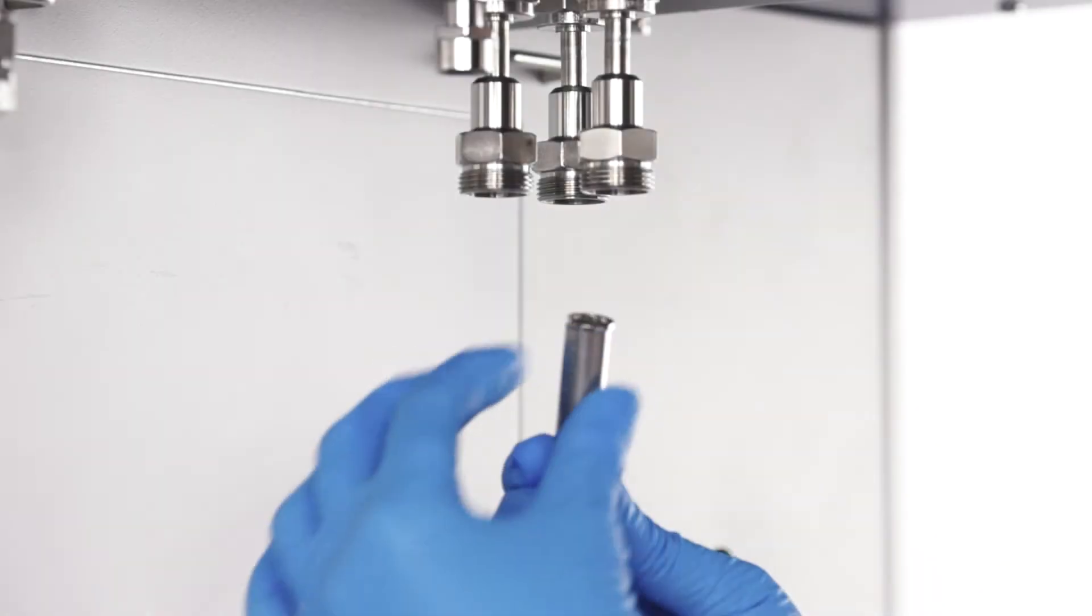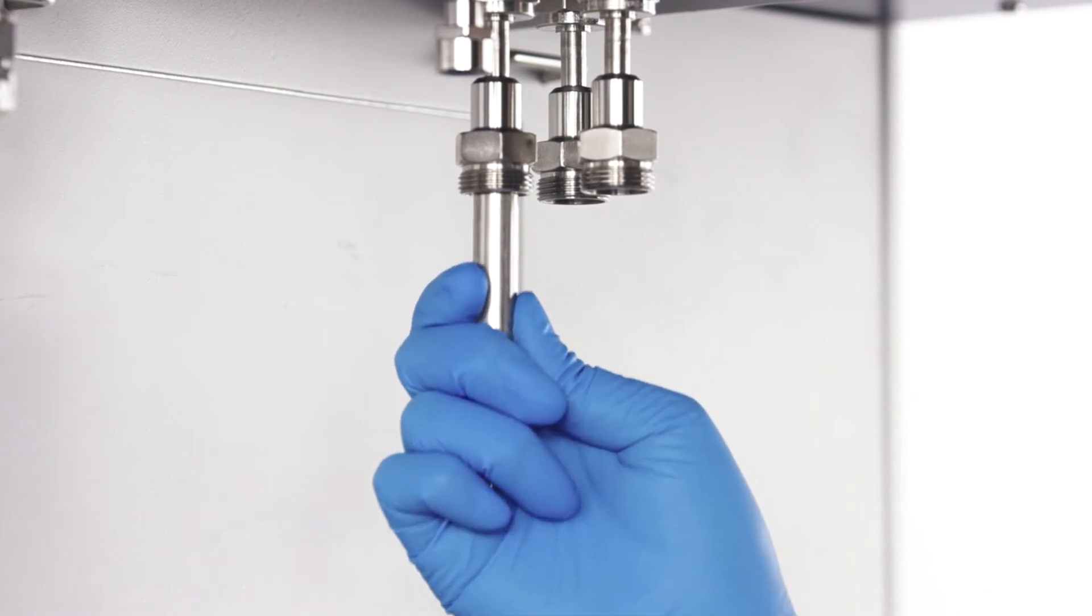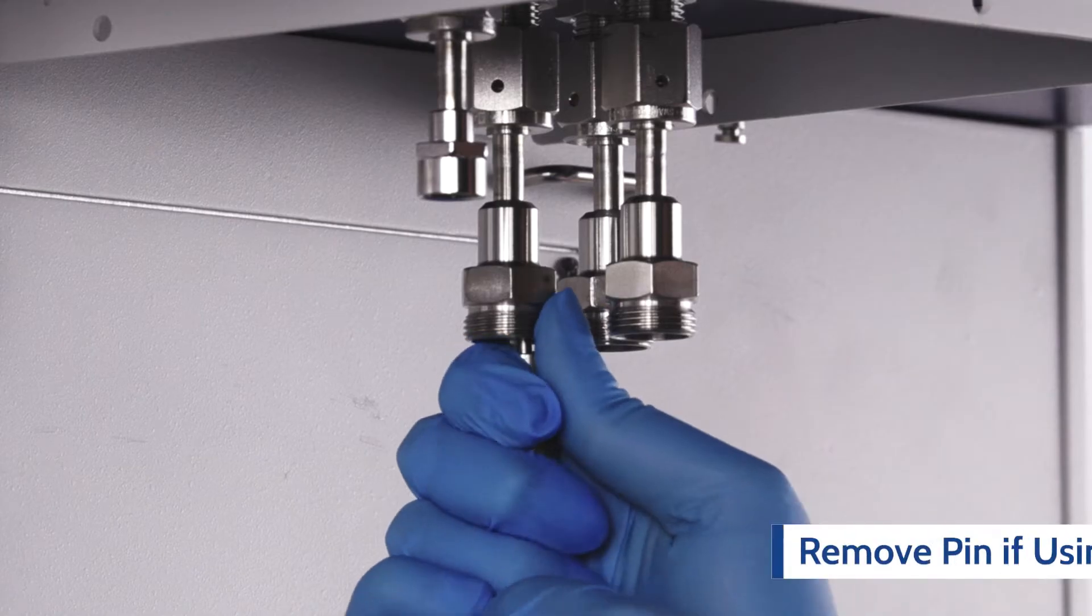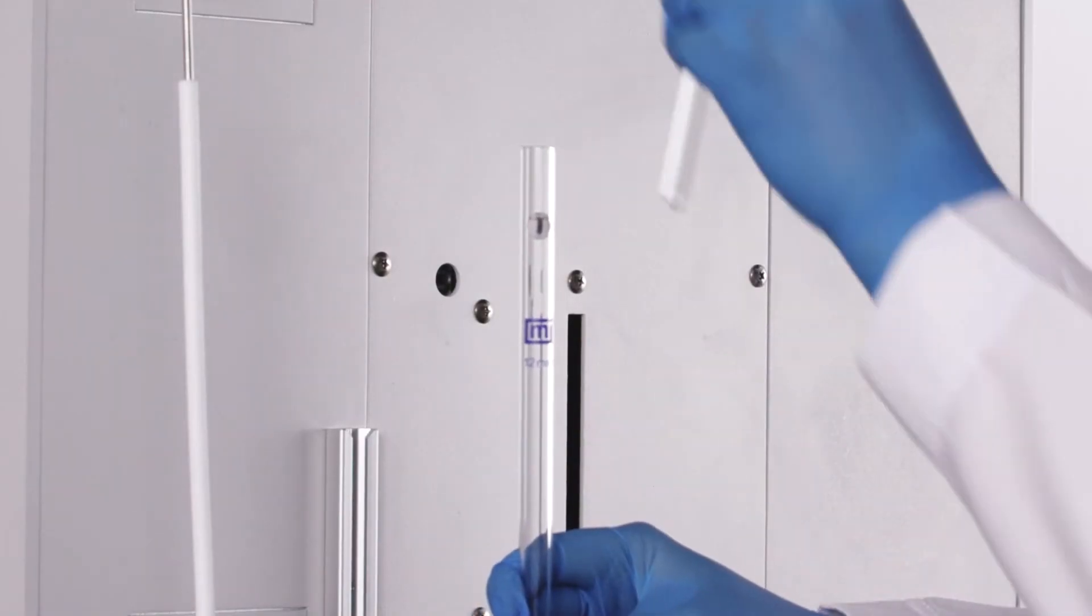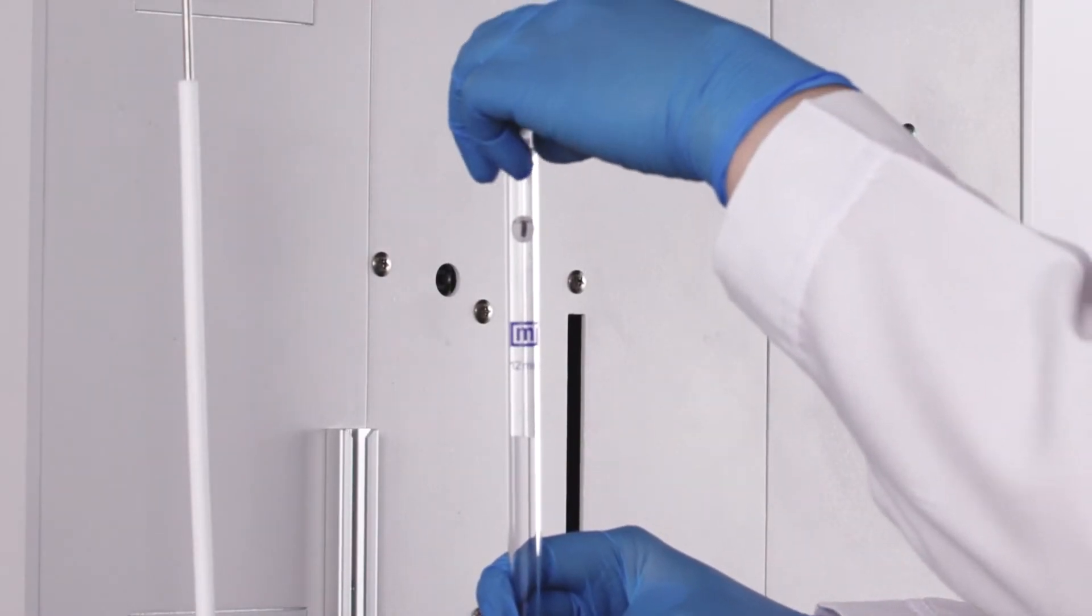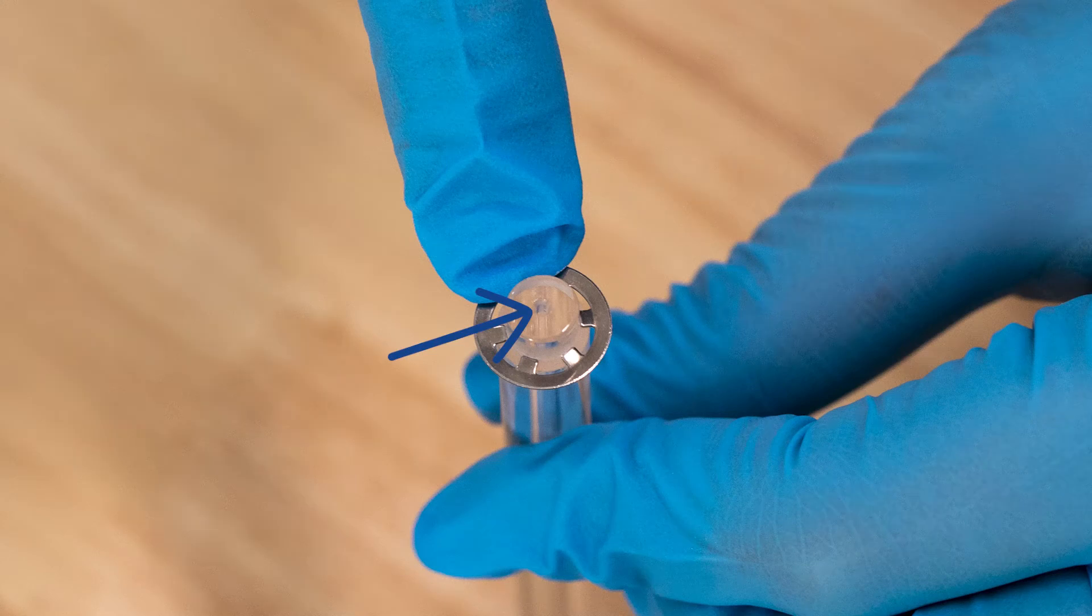Ensure the pins are installed in the sample port when a check seal is used. If you are using a rubber stopper, ensure to remove the pin from the sample port to place the additional hanging filler rod. The hanging filler rod has a precision bore hole that allows proper thermal transpiration correction calculations for micropore analyses.